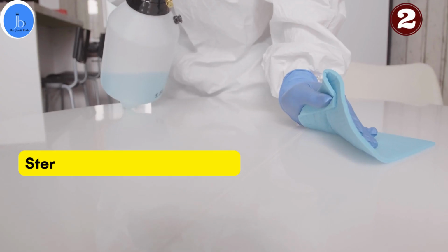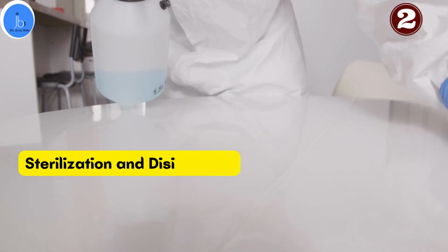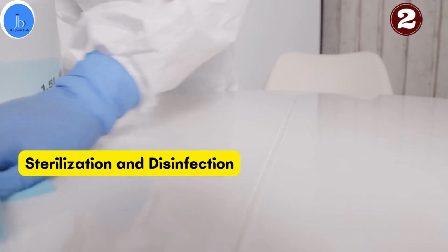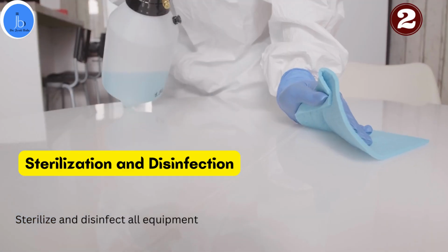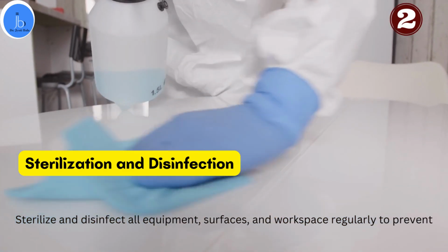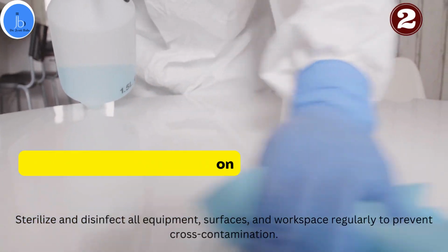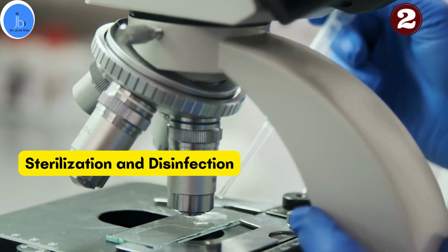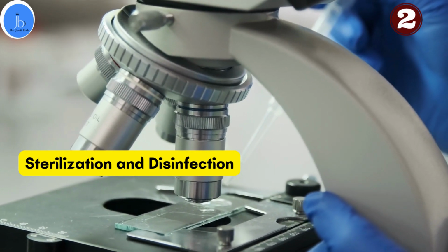Second, sterilization and disinfection. Maintaining a sterile environment is vital in the microbiology lab. Regularly sterilize and disinfect all equipment, surfaces, and workspaces to prevent cross-contamination. Make use of autoclaves, hot air ovens, and chemical disinfectants for effective sterilization.